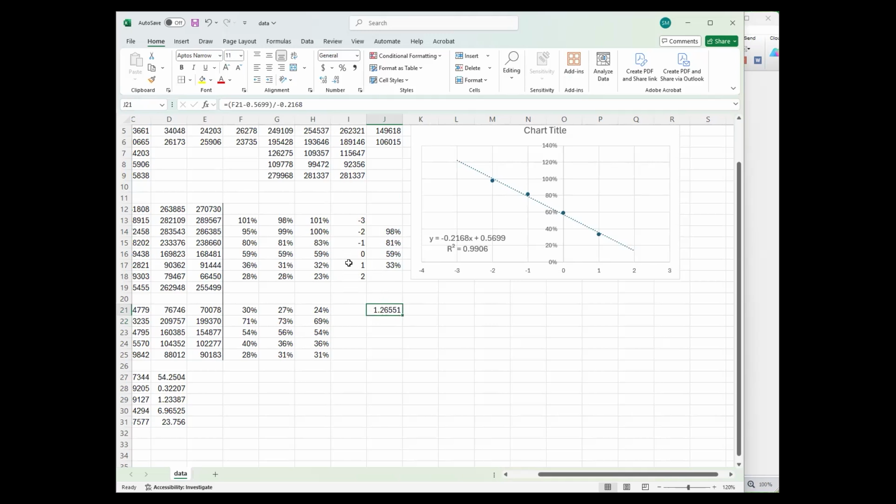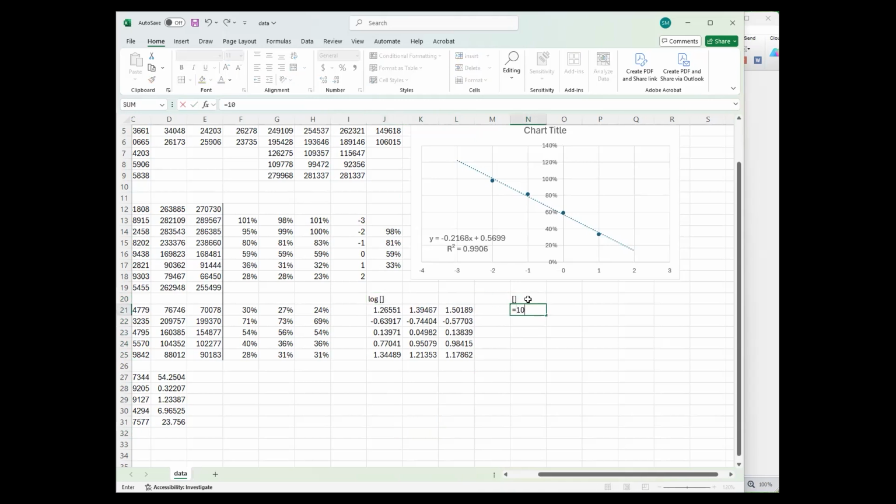so that's where we're getting into that. It's not going to be as accurate because we had to drop off between the two values. So if that right there is a red flag, I would take that and rerun the assay. All right, so now we can drag across and it calculates our values for each of these. And then remember, this is the log concentration of your unknowns. To get the concentration of your unknowns, you do 10 to the log power, and here we go.